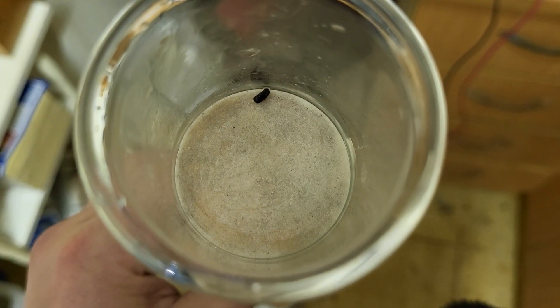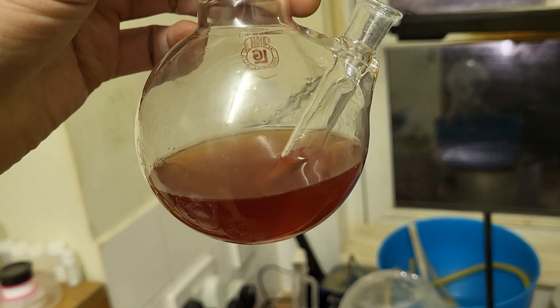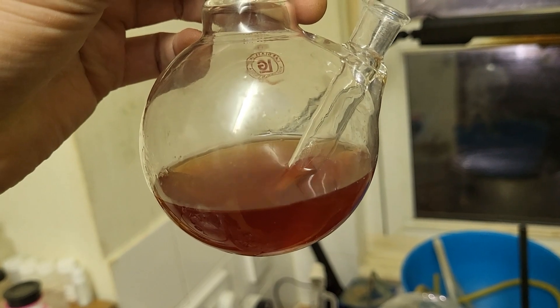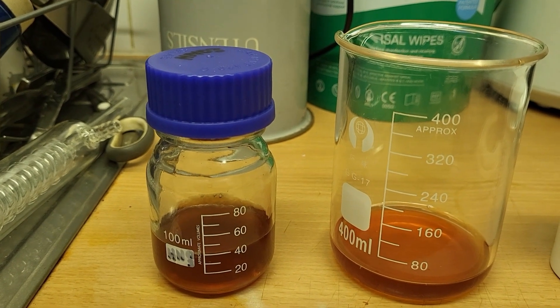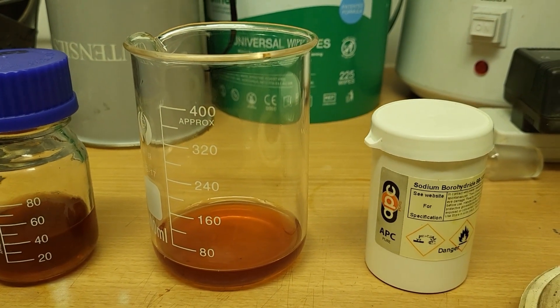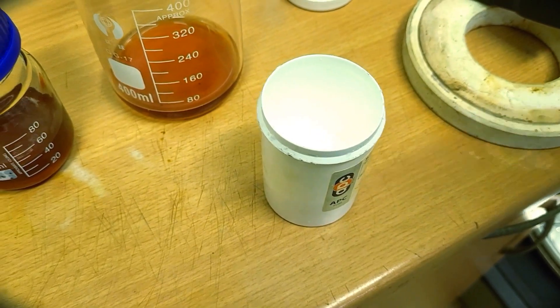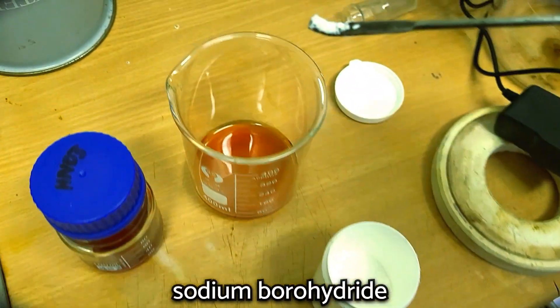There's a tiny bit of molybdenum left. Here's our molybdenum trioxide solution with a bit of nitric acid. I've split this into two — 40 mls in the bottle and 40 mls in the beaker. I'm going to add some sodium borohydride to the beaker in order to hopefully get molybdenum powder. Here's our borohydride. I'm going to take only a tiny bit and see what happens.